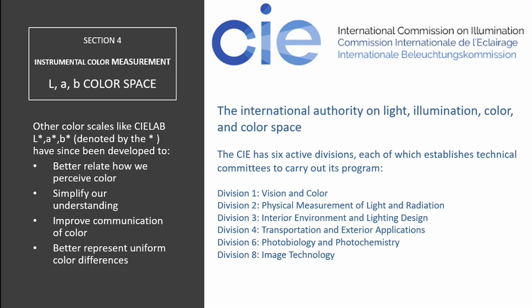Now, there are other color scales that are used. You may have heard of LAB and CIELAB. The difference between the two is that ever since LAB was invented by Richard Hunter in 1942, that model has improved. The CIE is the International Commission on Illumination. They're the international authority on light, illumination, and color space, so they're the industry standard, right?